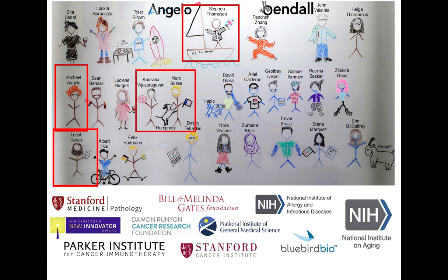The only overlaying and alignment that we have to do is for the tiling. And for the tiling approach, to full disclosure, I'd say the jury is still out on it. We are playing around with two types of tiling. One type, I'll call it clean edge tiling, where we literally tile edge to edge and we don't have any overlap, and then we count on the accuracy of the stage and the instrument stepping to be good enough that we can basically put the squares back together without any overlap. That's looking really promising, but you still get some artifacts where the stage doesn't step perfectly and maybe things are a little bit out of line.